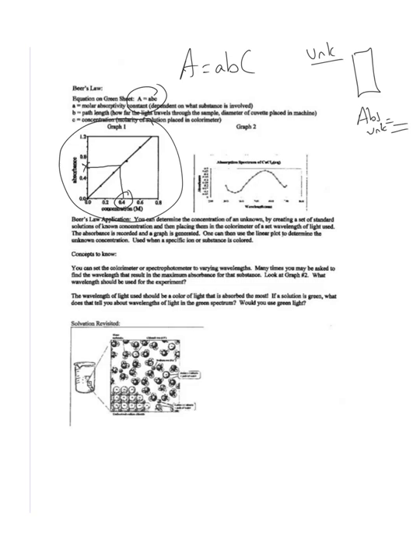As long as I create a graph of known concentrations. So if I know the sample contains cobalt, I'll make cobalt solutions of varying concentration, put them in the machine, get my beautiful linear graph, and then I can put my unknown in the machine to figure out what its concentration is. So this is how we utilize Beer's law. It's a quick, easy graphical analysis type of problem that we can use to figure out concentrations of colored substances.